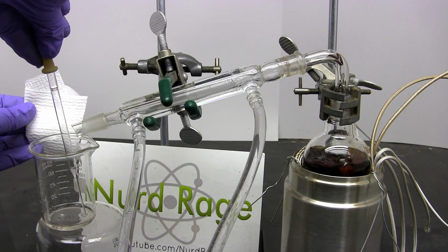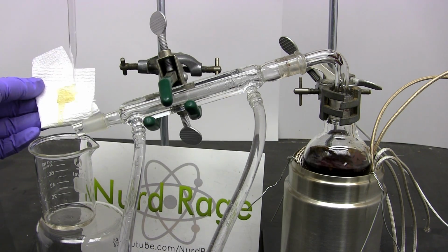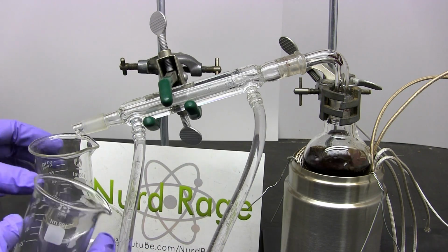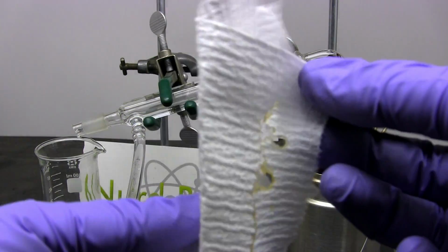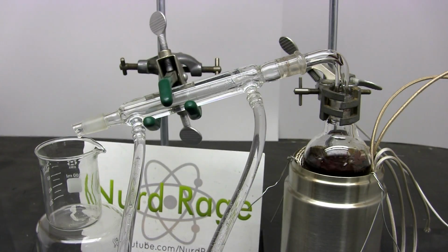Keep running this test and eventually the distillate will burn the tissue. This is a strong indication that we have more acid than water at this point. Change out the receiver and start collecting your acid. Here's a close-up of the tissue with the acid having burned clean through it. Now, while the acid is very concentrated, it's not yet the common 98% concentration that corresponds to azeotropic sulfuric acid.